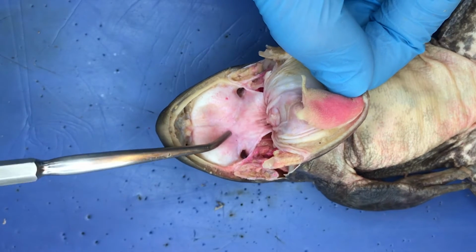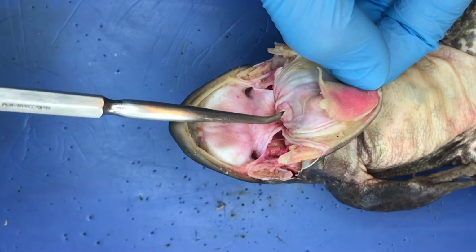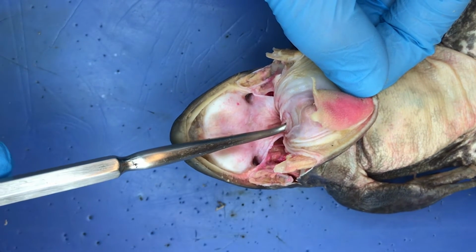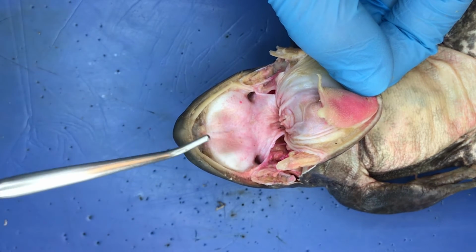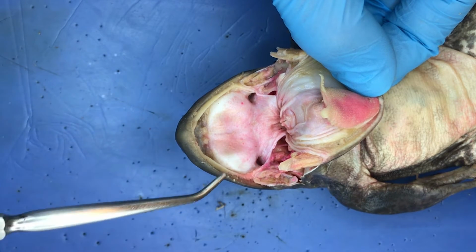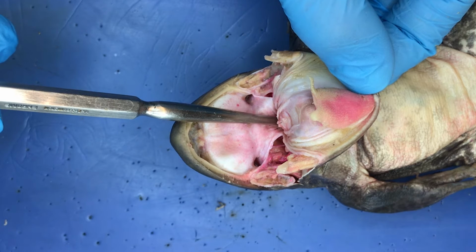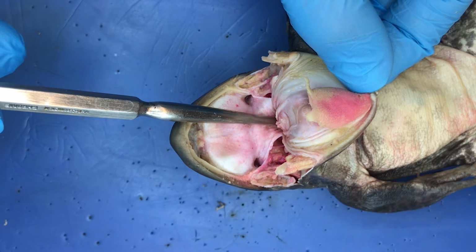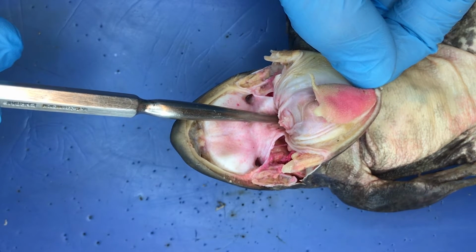Behind the tongue, on the floor of the pharynx, is a raised area with a vertical slit, which is the glottis, the opening to the larynx and trachea. Posterior to the glottis is the esophagus. We can see its opening appearing as a horizontal slit in the back of the oral cavity.